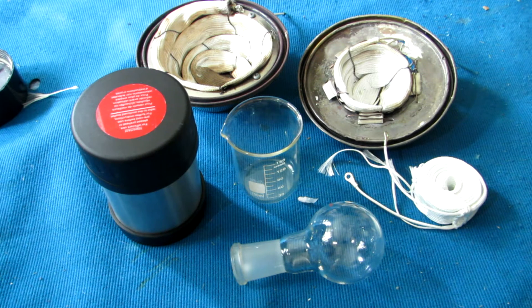Hey guys, welcome back to another video. Today I'm going to show you how to make a cheap, super high temperature heating mantle.